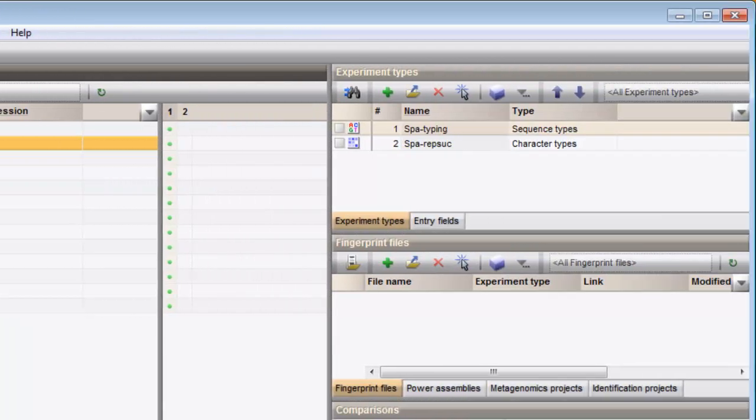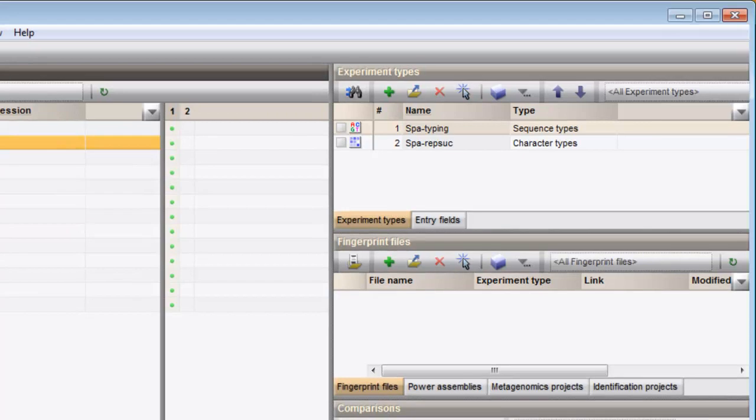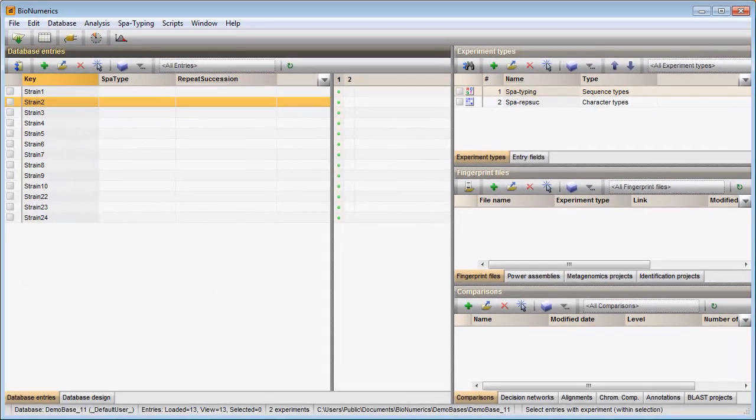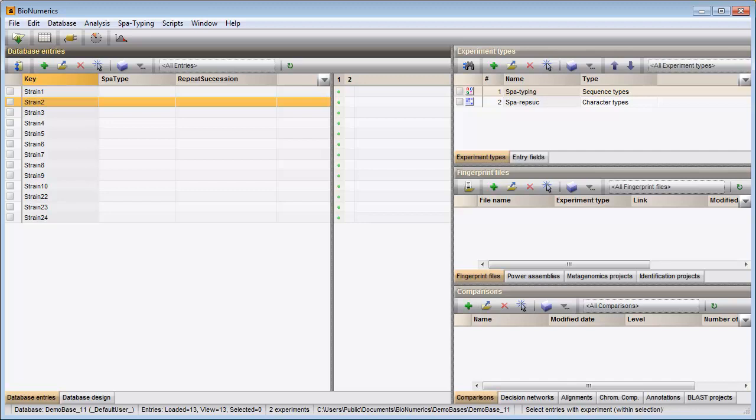All experiments are listed in the Experiment types panel. For each experiment defined in the Database, there is a column present in the Experiment Presence panel. Since two experiments have been defined in this database, two columns are present here.